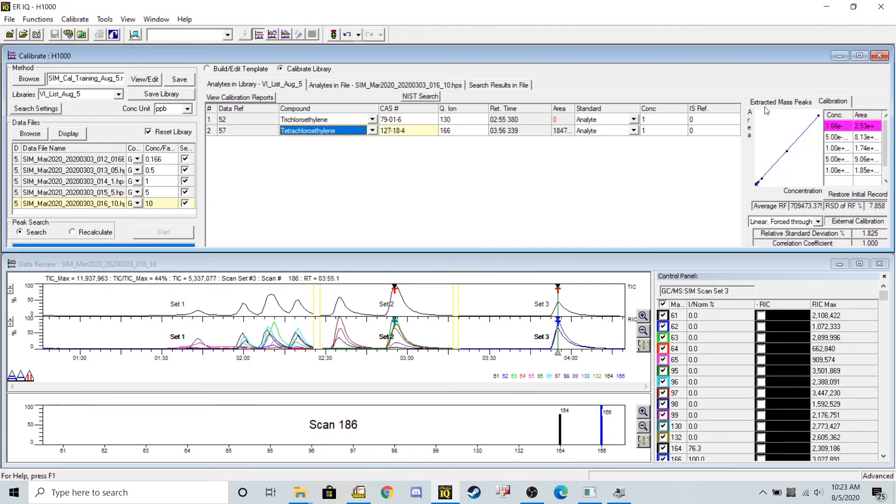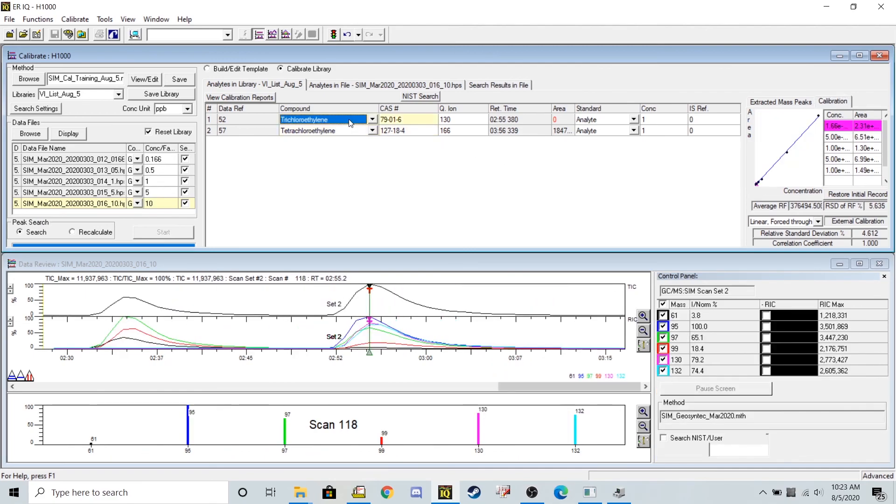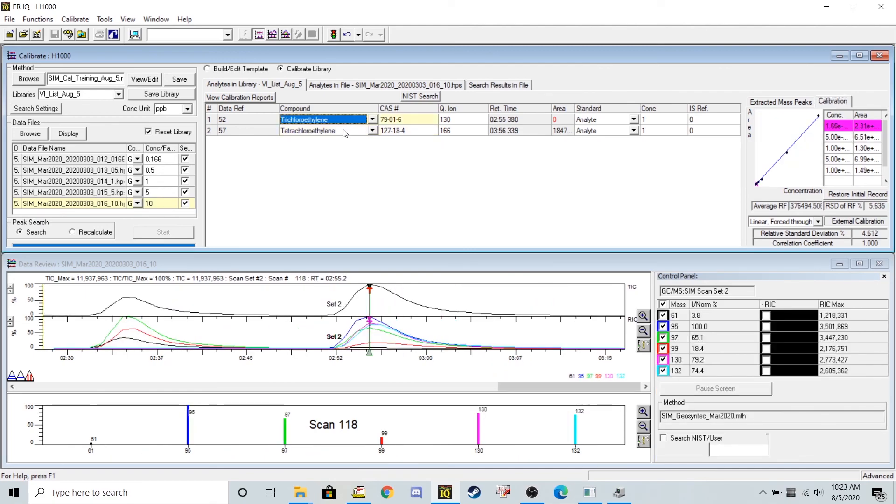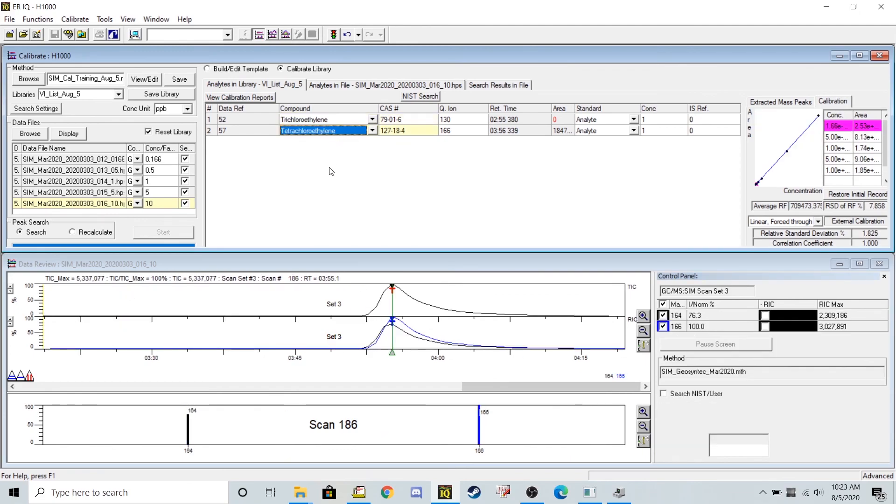I now have a nice calibration curve for my tetrachloroethylene. And trichloroethylene as well.